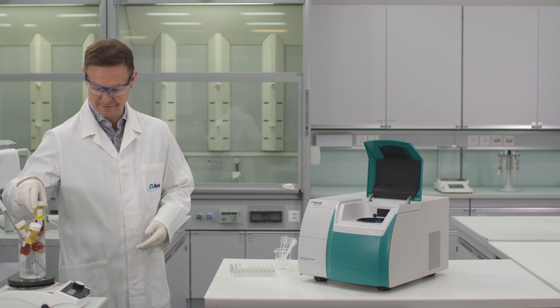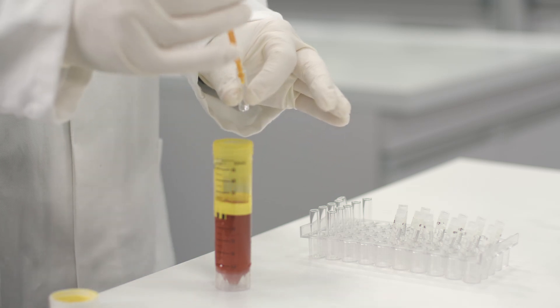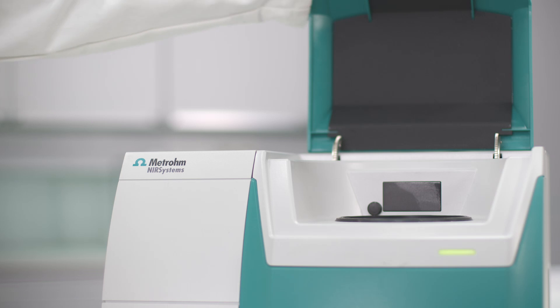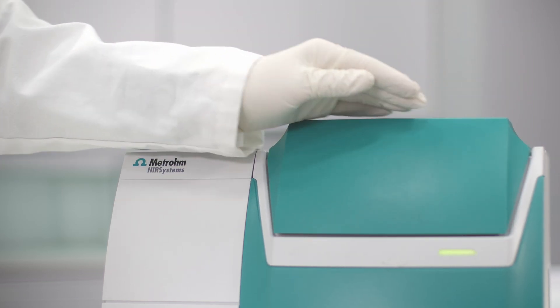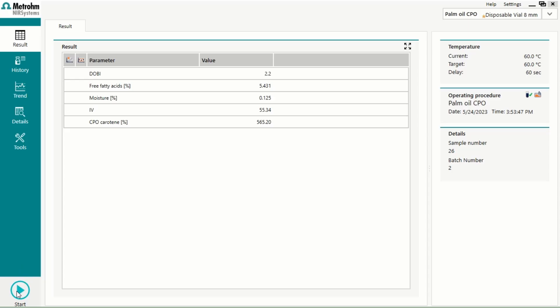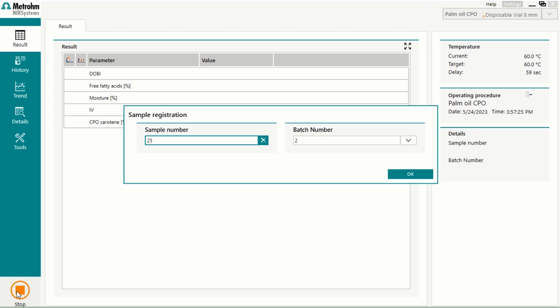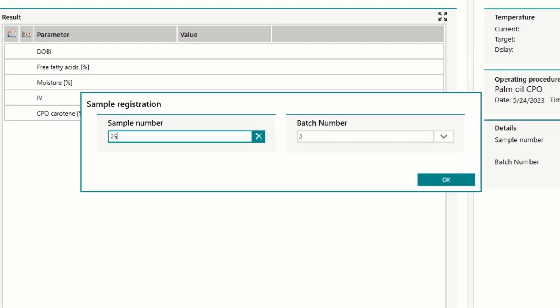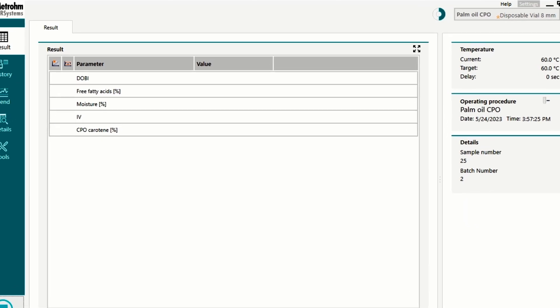All you need to do is fill your sample in the disposable vial, place the vial in the DS2500 liquid analyzer, and close the lid. The software starts the measurement and only requires you to enter all necessary information, such as sample name or batch number.